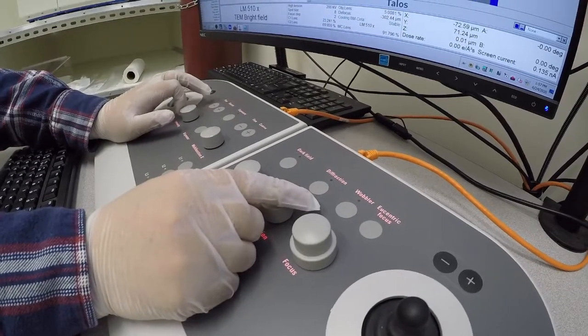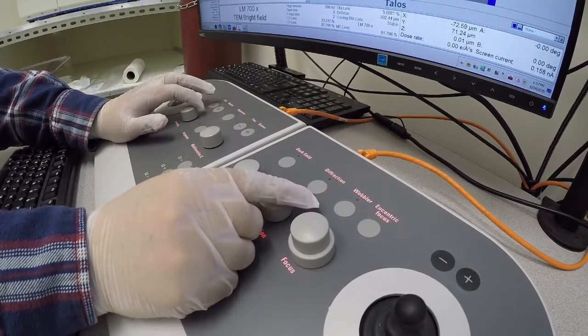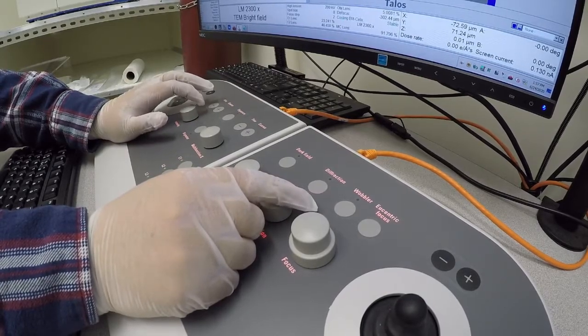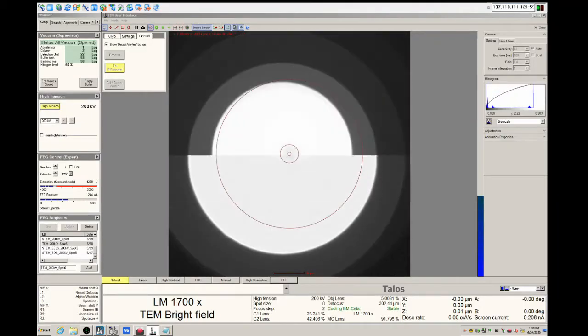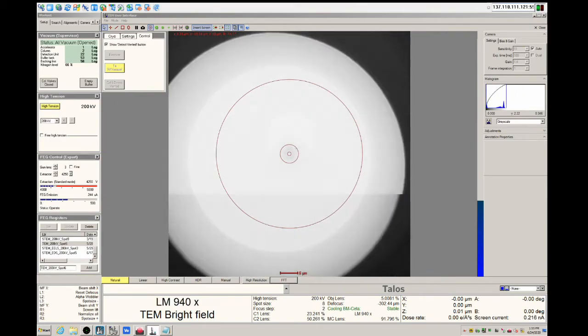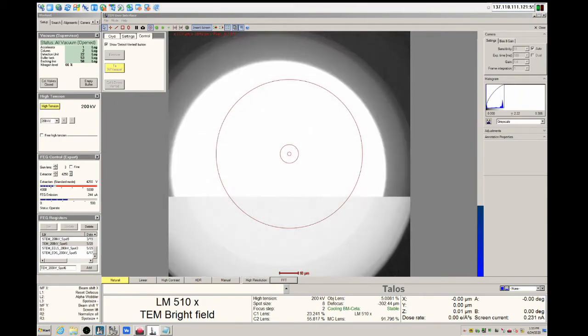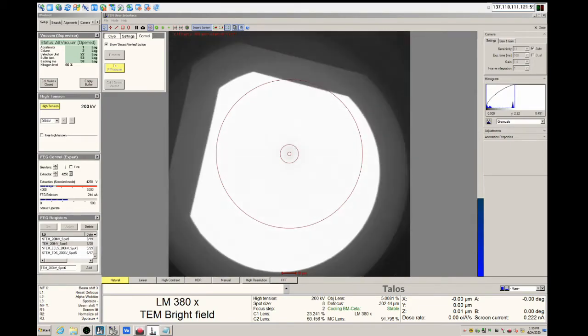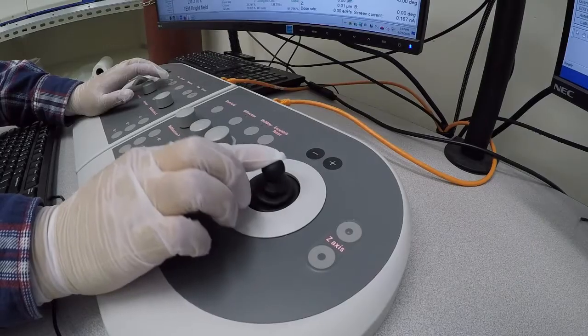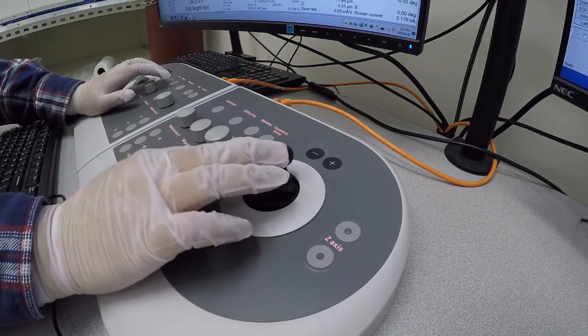By simultaneously using the magnification and intensity dials, de-magnify to get a zoomed out image of your sample. In this instance, we will be looking for a FIB prepared TEM lamella. The lamella is in the lower left of the screen. You can use the joystick to adjust the stage position.